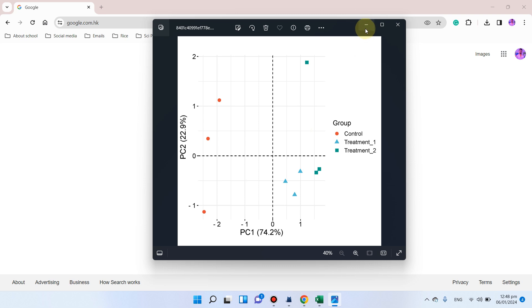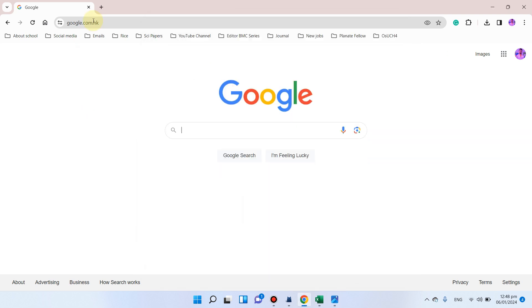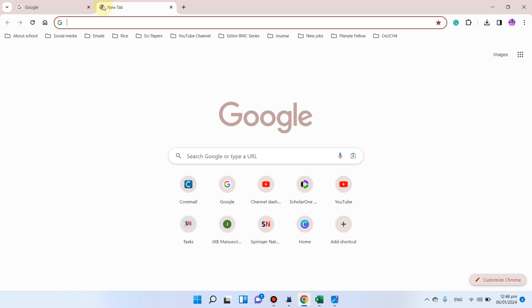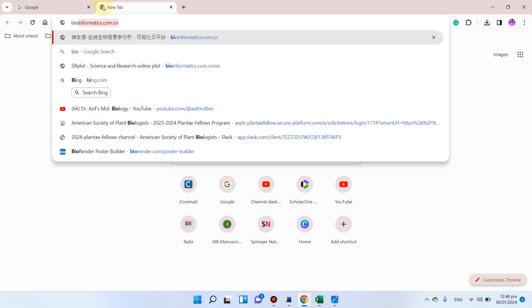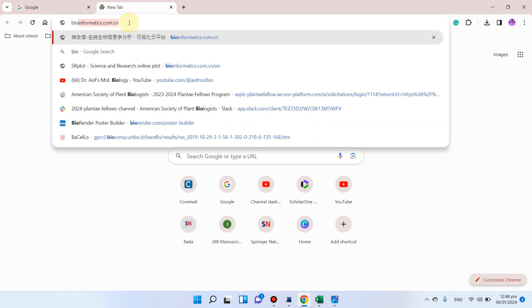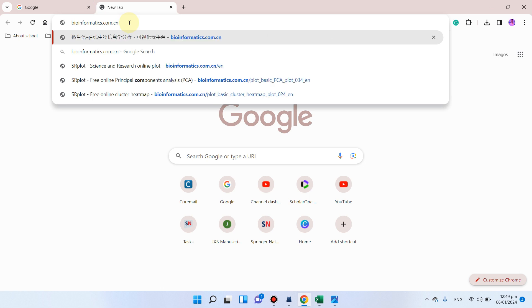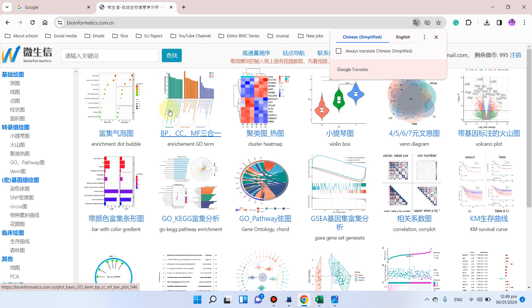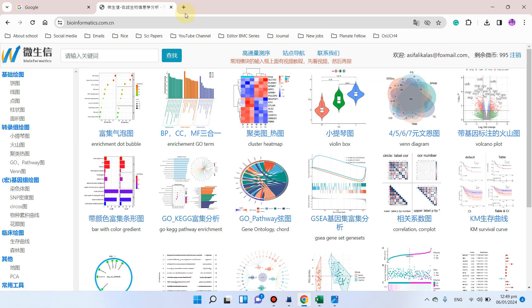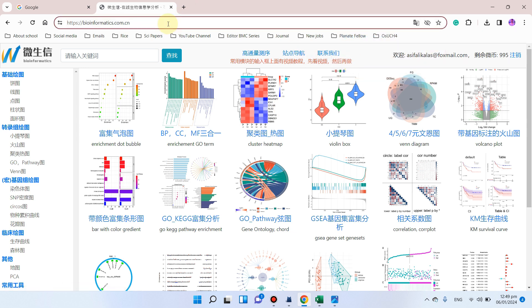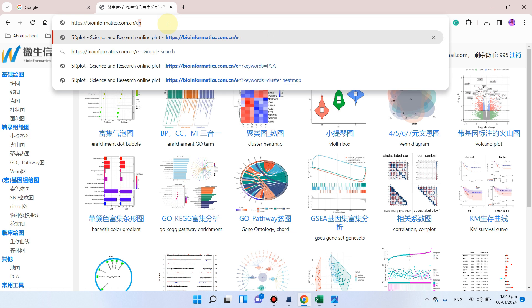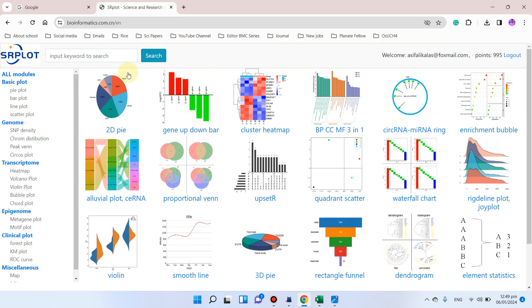First of all, let me open the srplot website. As we know, the srplot website is bioinformatics.com.cn. This website is in Chinese, so if you want to get the English version you can add slash 'en' to the URL. Here is the English version of the srplot website.